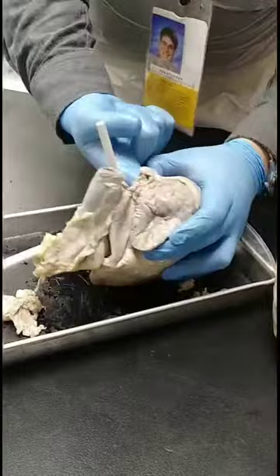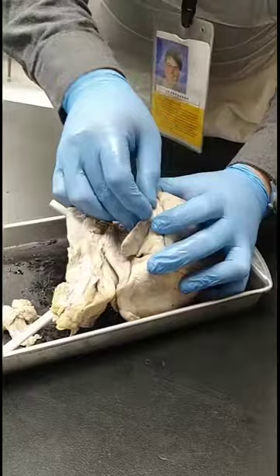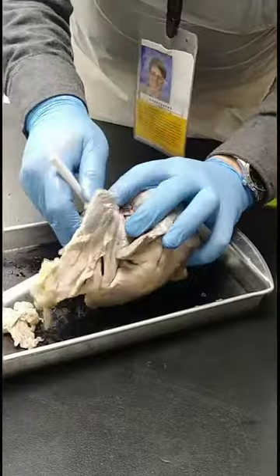This is the auricle. The auricle covers the atrium and expands a little bit, giving it more room when it's full of blood. Normally it's bigger when it's full of blood, but it's all gone. It's been squished a little from being vacuum sealed. You just kind of imagine what this looks like beating.